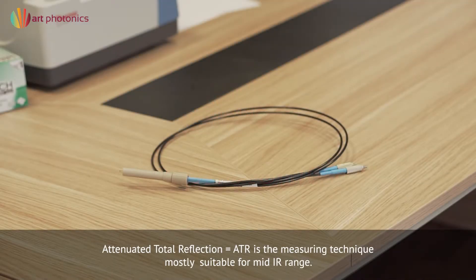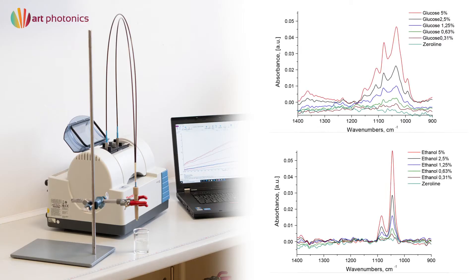ArtPhotonic's product line FlexiSpec includes various fiber probes for the mid-infrared range, which are mostly ATR based. Infrared fiber probes are used with FTIR spectrometers for measurement of optical absorption spectra of mixtures and substances.